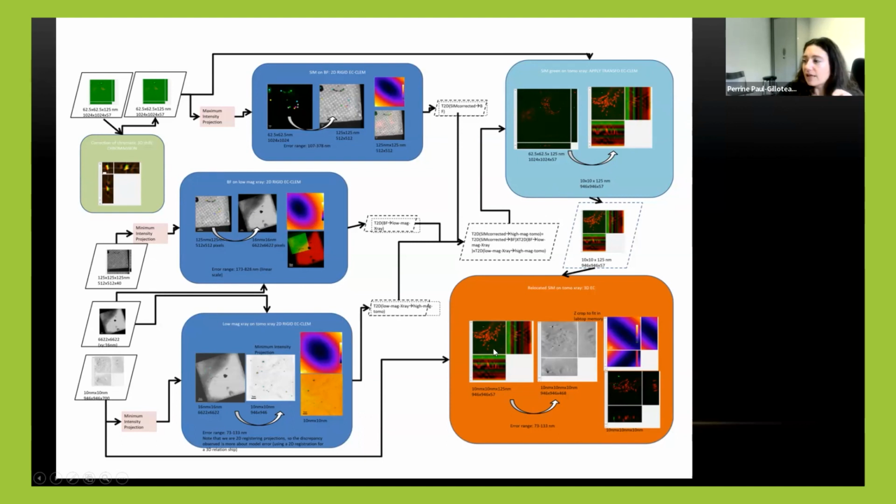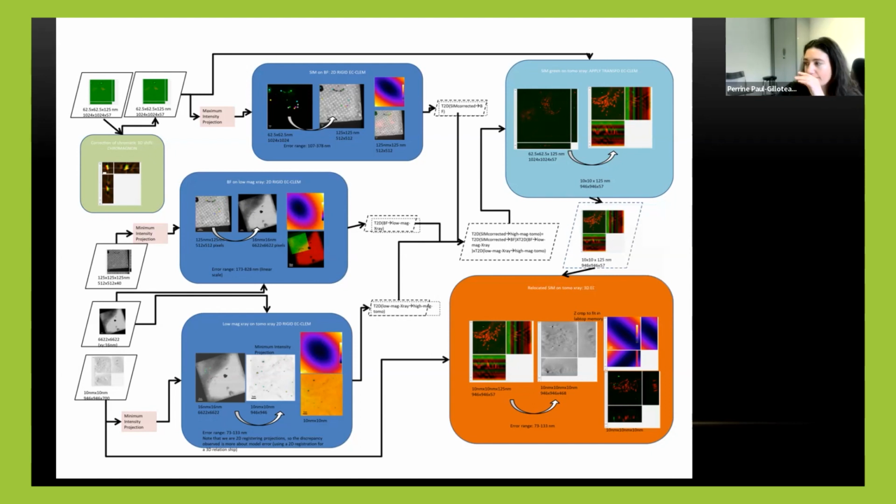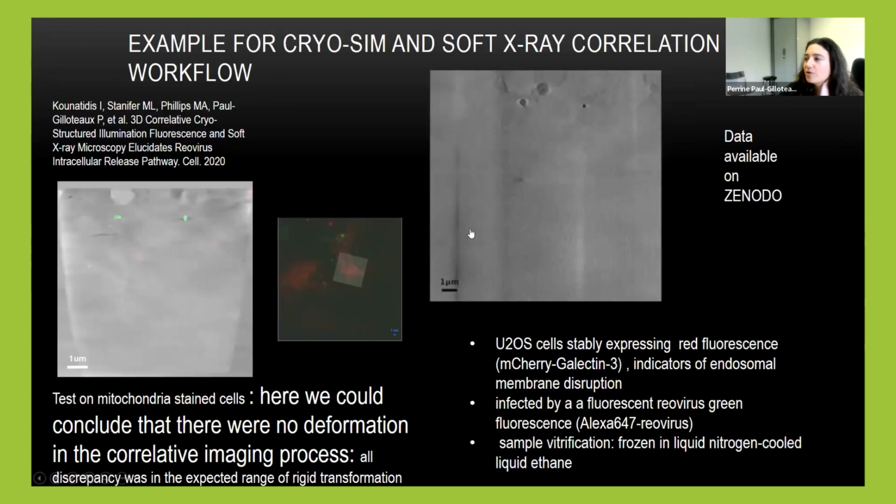And that can serve then as an initialization, because now it looks a little bit more easy to register for a proper 3D registration, taking into account the tilt, for example, that you can see, and the difference in resolution in Z. So for now, the interface is kind of not easy, so that's why it's still in beta version, but very soon there would be a nice interface where you say which image you want to register, and that will help you to know what is missing as link and this kind of thing. So that's the kind of results that can be obtained thanks to the workflow.